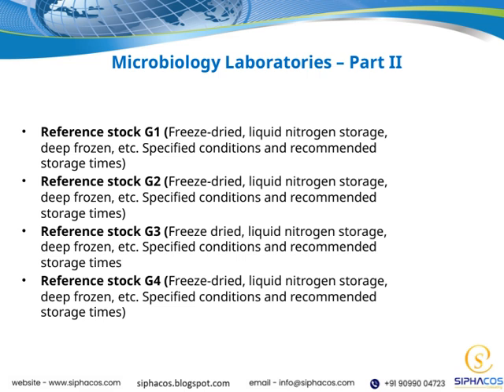It's crucial to pay attention to the specified storage conditions for each stock because they directly impact the viability and integrity of the samples over time. For example, G1 might have recommended storage times under certain conditions, and those times could differ for G2, G3, and G4.